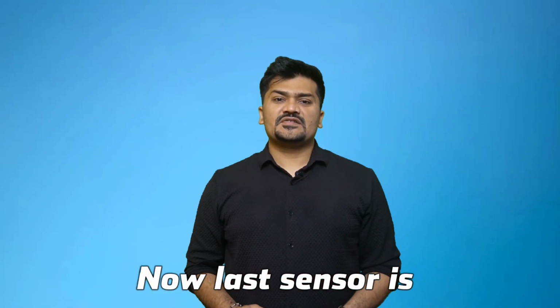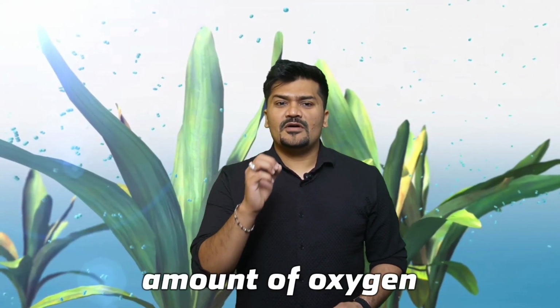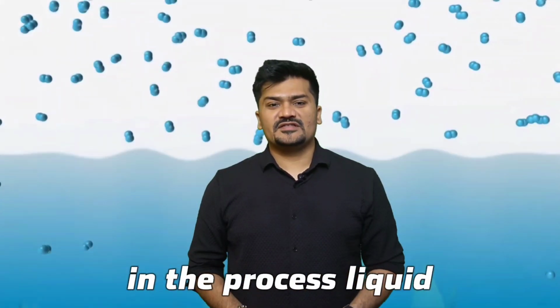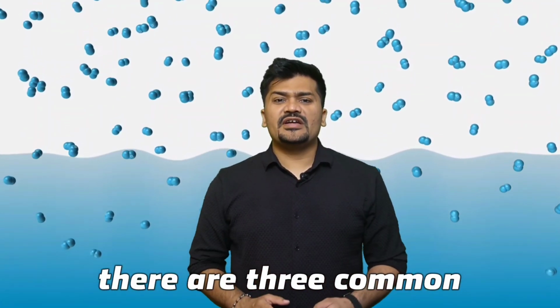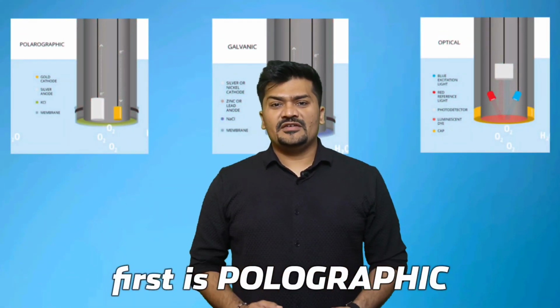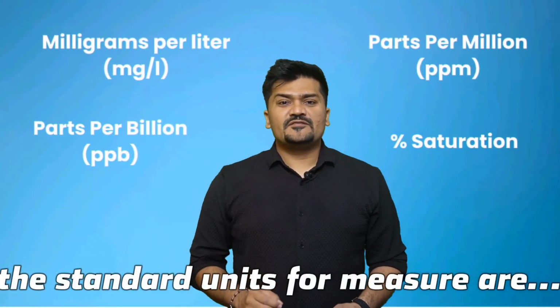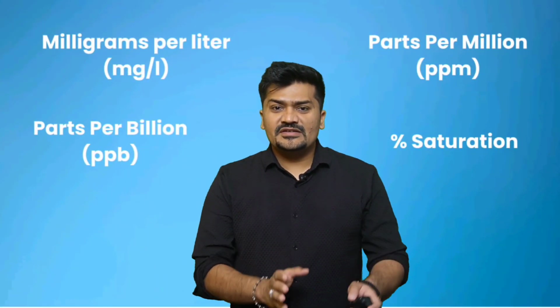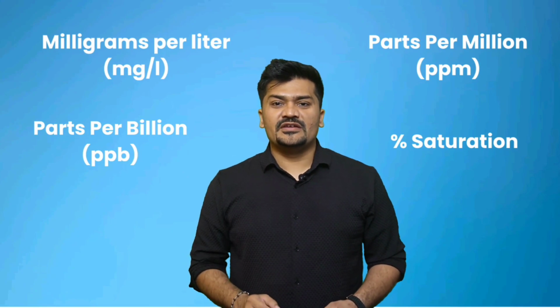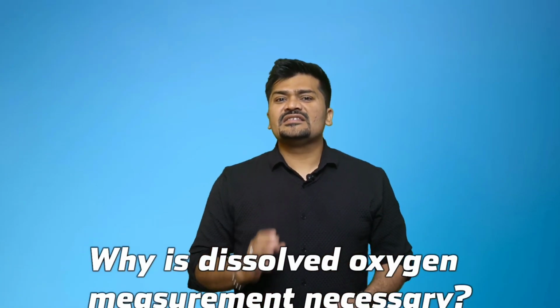Now the last sensor is dissolved oxygen sensor. Dissolved oxygen is determining the amount of oxygen dissolved or carried in the process liquid. There are three common technologies for dissolved oxygen measurements. First is polarographic, second is galvanic, and third is optical. The standard units for measures are milligrams per liter, parts per million, or parts per billion, or you can also measure in percentage saturation.